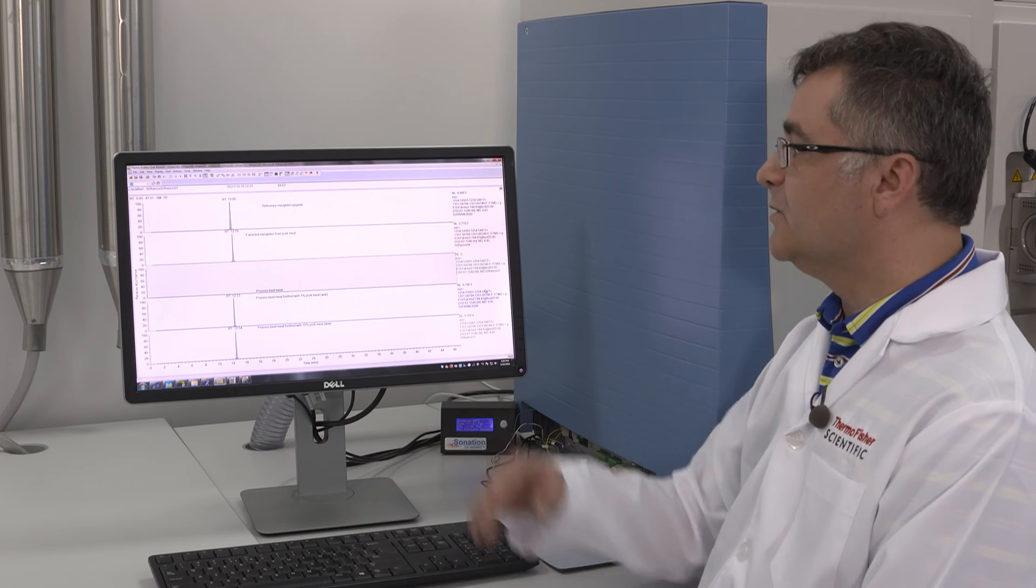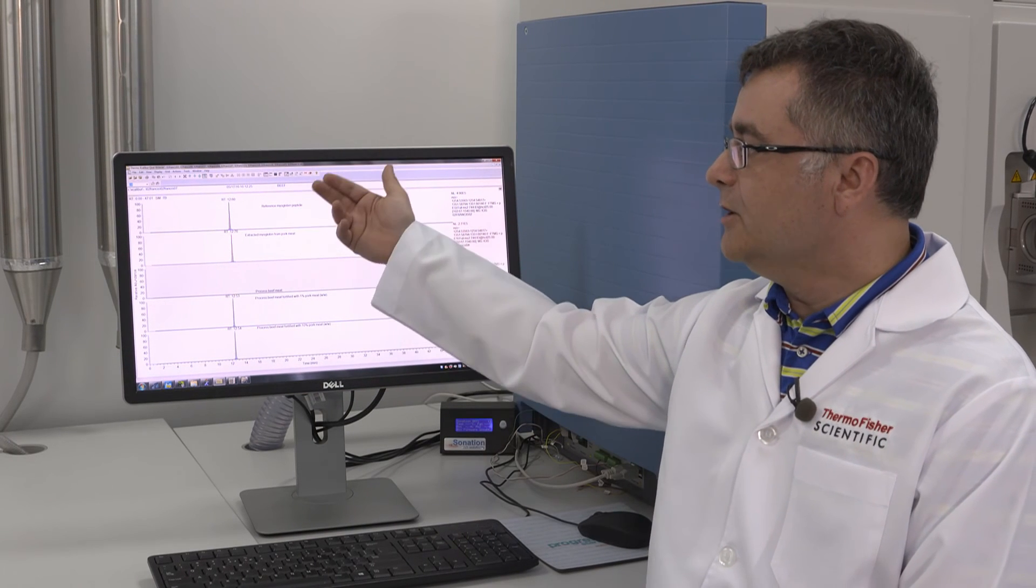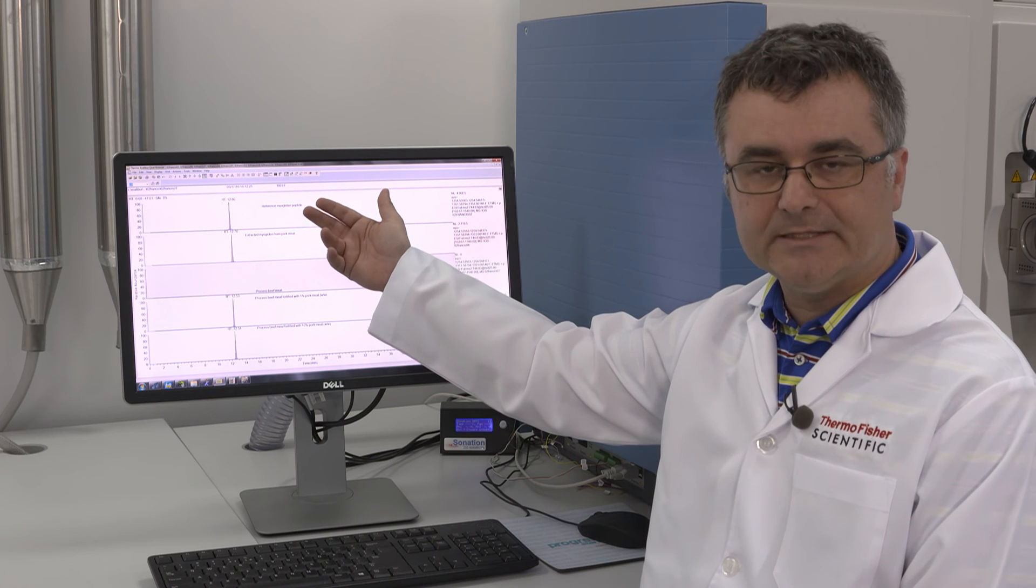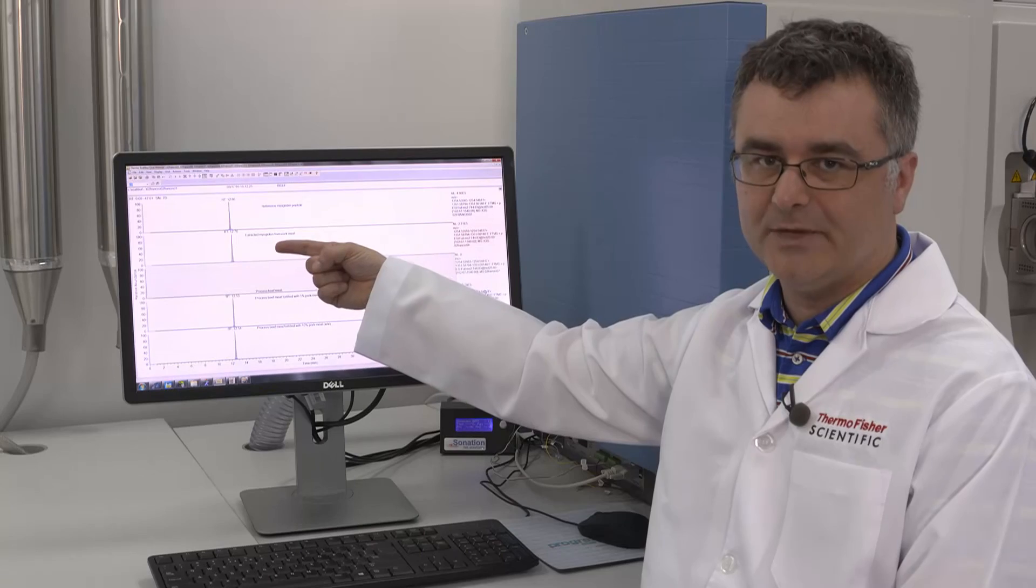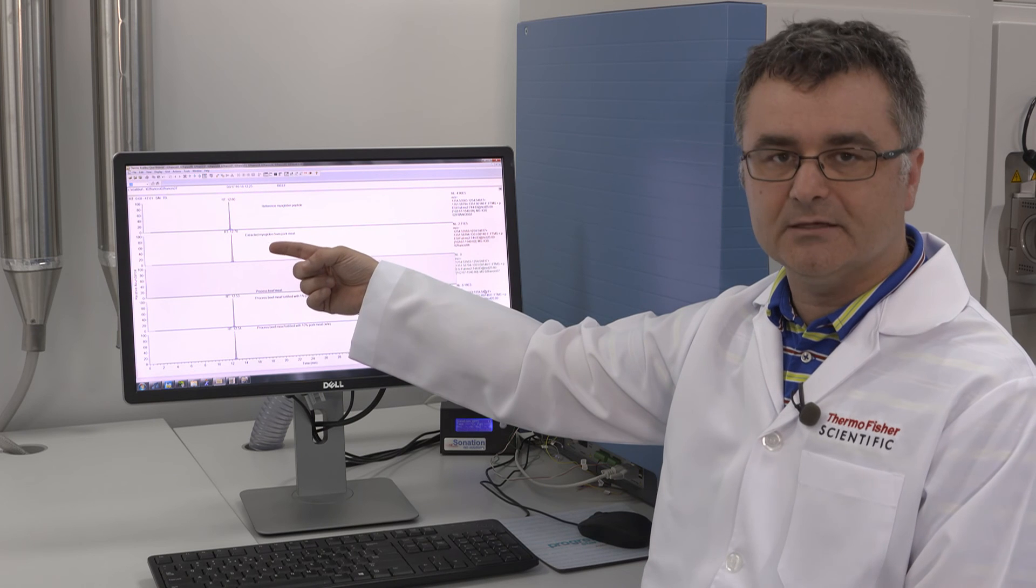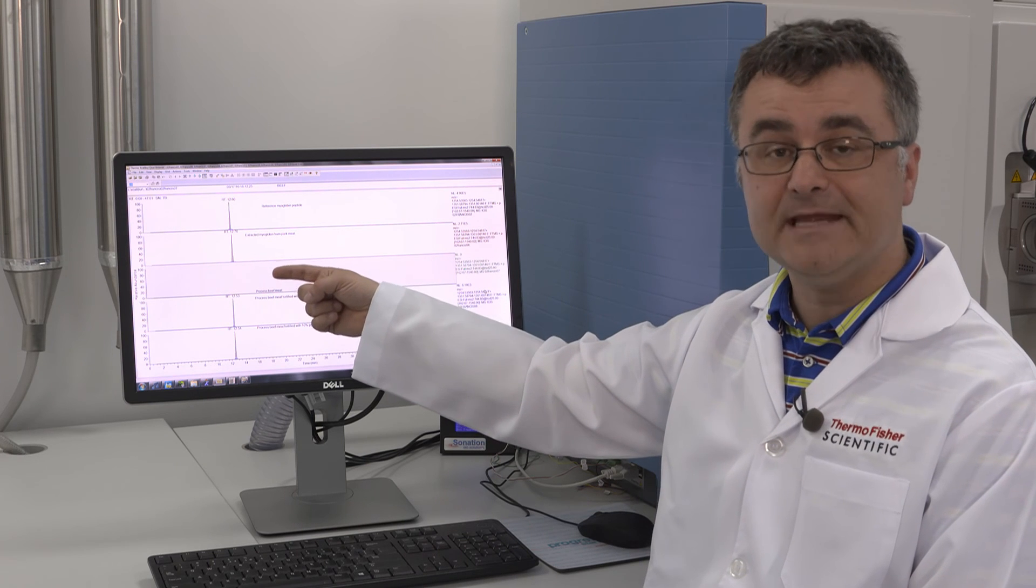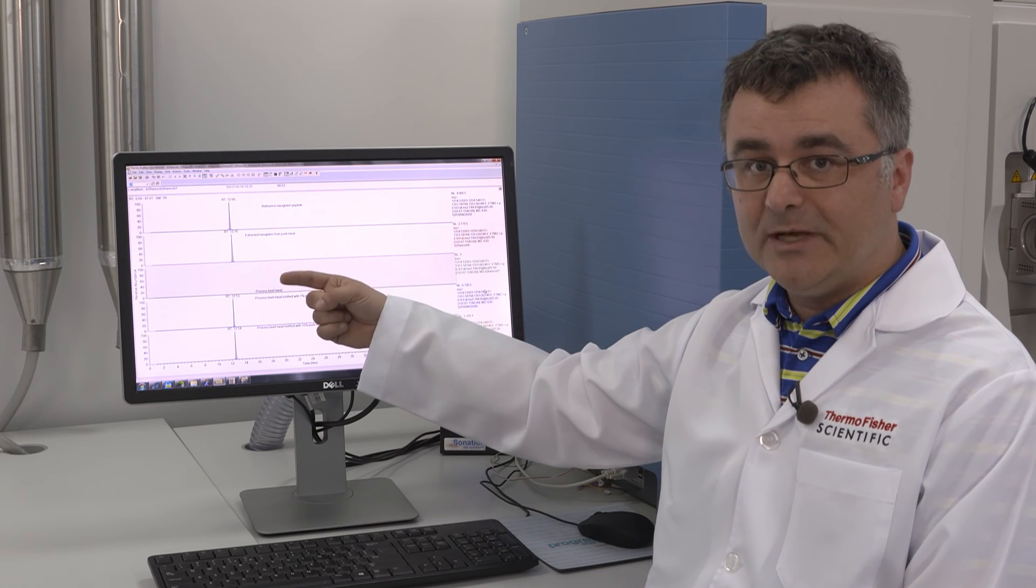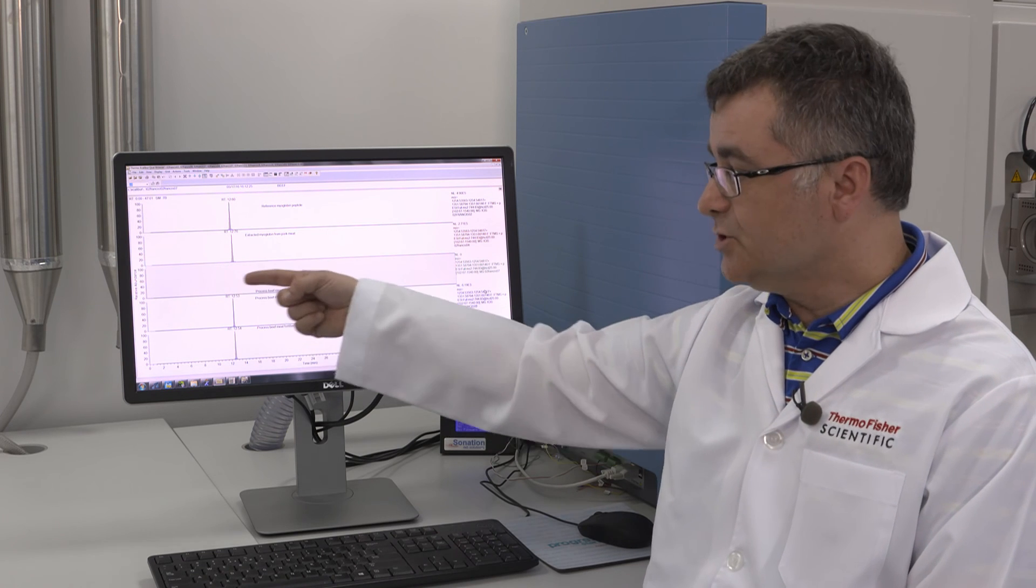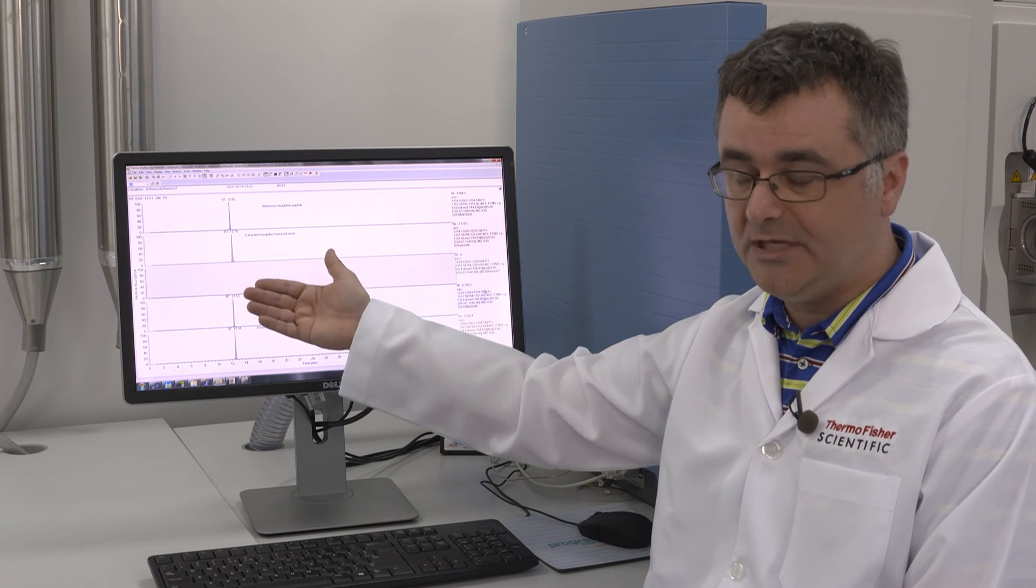Let me show you some of the results in targeted MSMS mode. When you look at this screen, you will see five different analyses. The first one are reference myoglobin peptides that we do target. We can see very abundant signal in MSMS. The second chromatogram are extracted myoglobin peptides from pork homogenates. The third one uses the same mass transition but extracted from a chromatogram generated with beef homogenates.